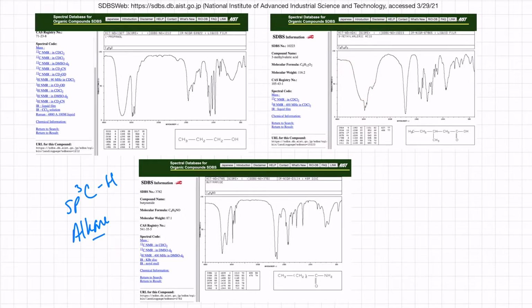And so if you see this kind of merging into the 3000s here, where we have our sp3 CH bonds, we know that that's like a distorted alcohol, and if we see it in conjunction with that, oh my goodness, okay, there is a carboxylic acid. So this plus this tells us carboxylic acid. Once again, right here, these little peaks in here, those are sp3 CH bonds.